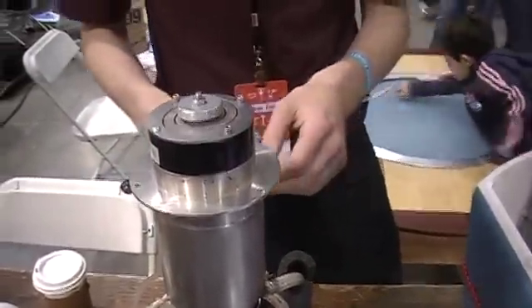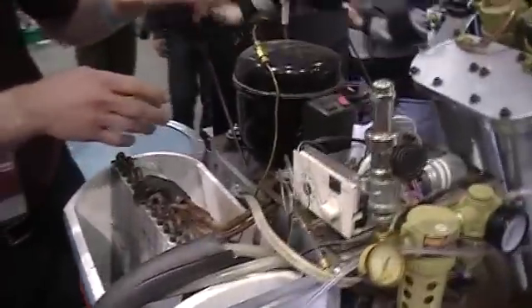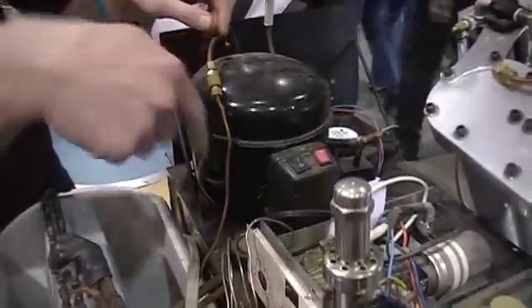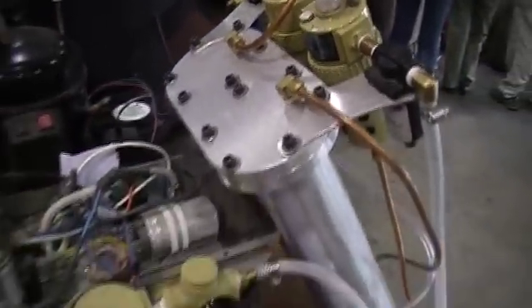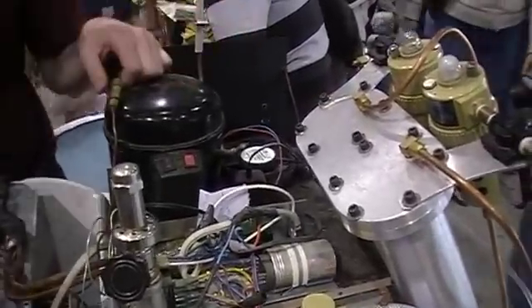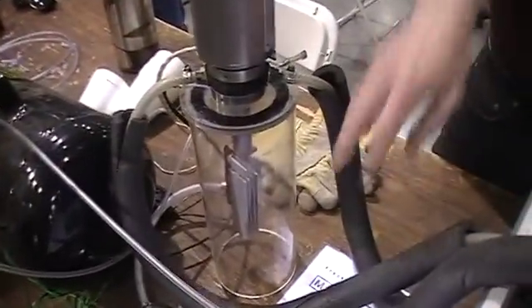And that's basically the key part of the liquid nitrogen generator. Do you just run regular air through or do you have a nitrogen cylinder? The rest of the device is sort of over here. The device runs on atmospheric air — air is sucked in and it goes through a series of filters which filters out the oxygen and the water. It's actually a permeable membrane, very similar to a molecular sieve. So you end up with a dry nitrogen line. Dry nitrogen is collected in the tank here, and then it's added to the dewar as needed as it's liquefied.